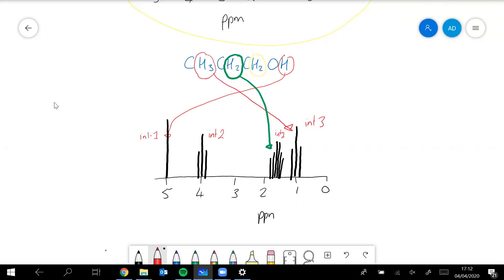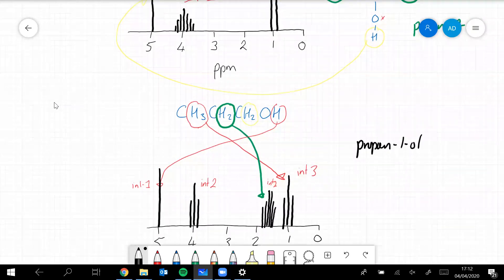So you can see propan-1-ol, very similar molecule to propan-2-ol, but it gives us quite a different NMR spectra. You just look at those two together.